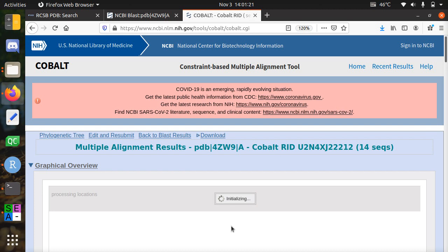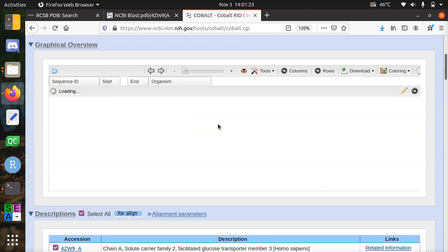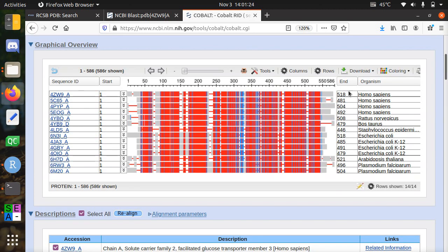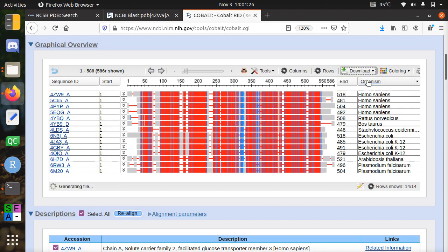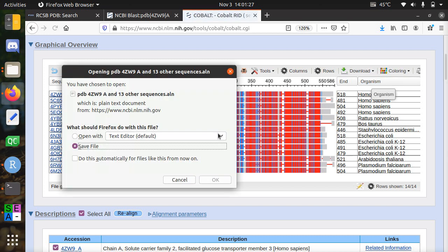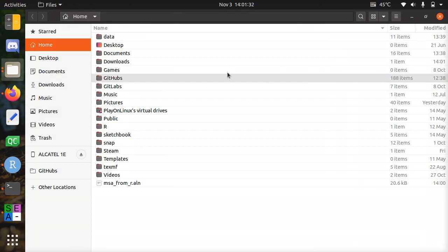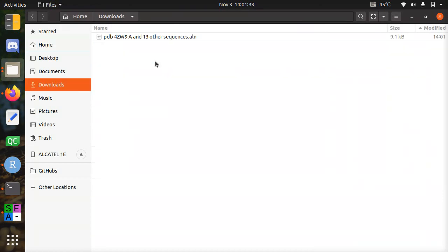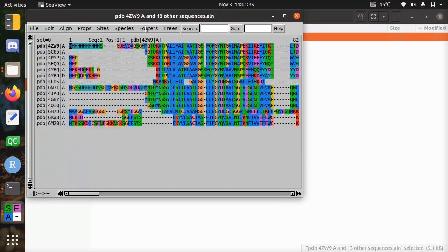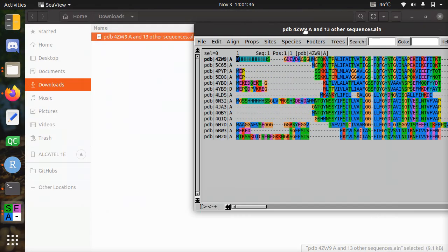And it already produced an alignment that I can download as a FASTA alignment. Save it to file. This will be saved to my downloads folder. And here we can see it.